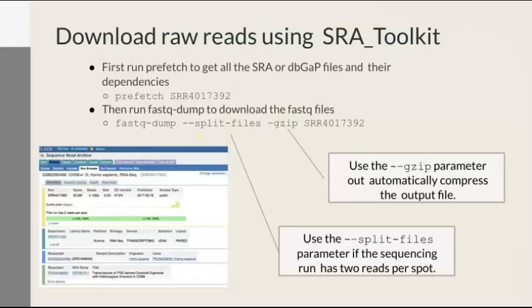So I'm going to end the lecture right here. What we're going to do now is actually play around with understanding how to get data, and then from the data do some quick quality control and some quick processing with it. So we'll do a FASTQC, we'll trim the reads, and we'll align it to our reference genome.